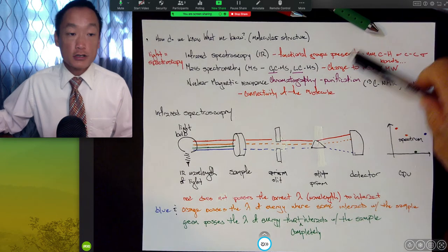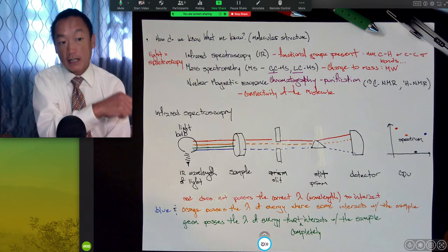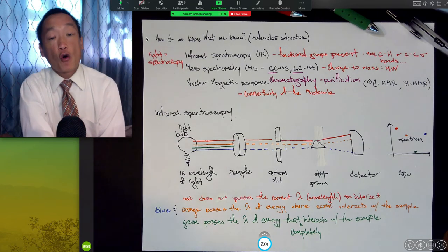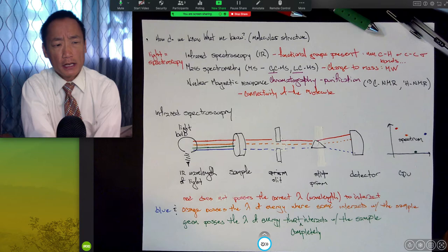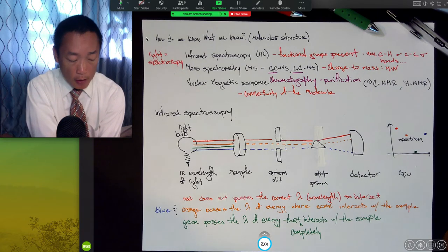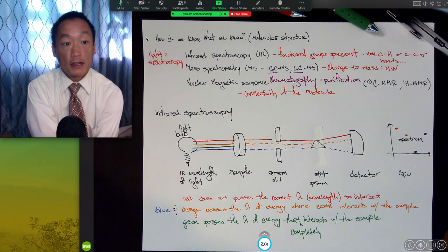And what your instrument is doing is it turns it on, takes a reading, does it again, does it again, does it again, and every 4 scans, if you've done any sort of Fourier transformation, partial differential equations, that is the type of mathematics that you need 4 scans in order to convert.